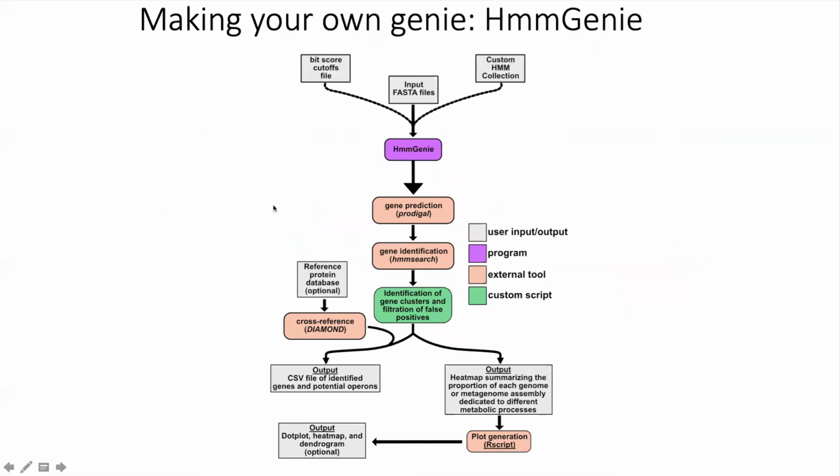So HMM Genie, the make-your-own-Genie part of the slideshow. HMM Genie is kind of the same, except that instead of having a predetermined collection of HMMs included, you can provide your own HMM collection. And I'll talk about how to go about doing that in the tutorial.